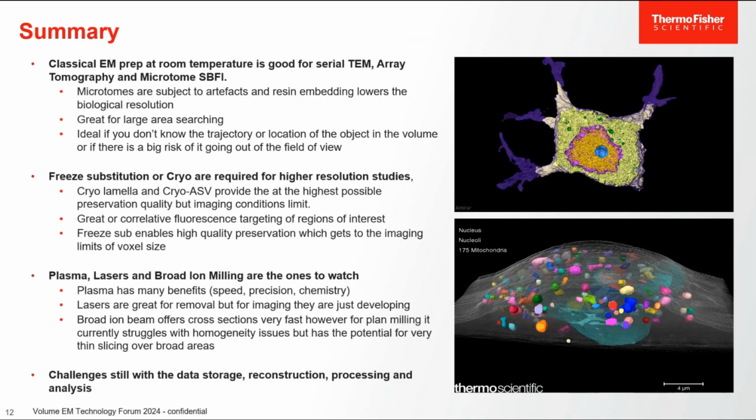You can go up if you want to. I think if you're just trying to do minimum slice thickness, it would be 100. But if you're trying to do, say, a micron, 10 micron steps, yeah, absolutely, you can mill that away in a few seconds.